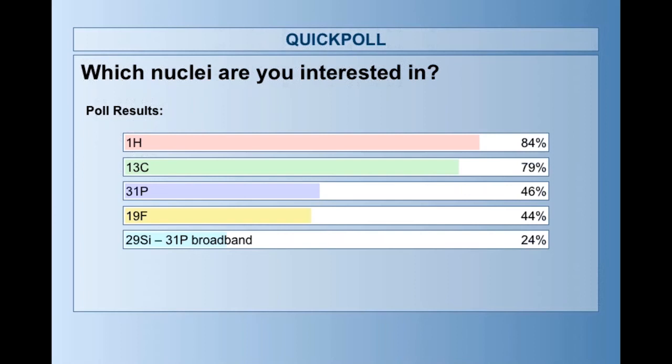Just before we hand over to Ryan, one quick question that I think may just be a case of the language that we're using. When we're talking about benchtop NMR, we mean that quite literally, don't we? We mean an NMR machine that is literally on the bench in front of you, rather than the very early ones, which required incredibly large cooling systems and so on, and essentially were a room of their own. So Bilal has asked us if that's what we mean by benchtop.